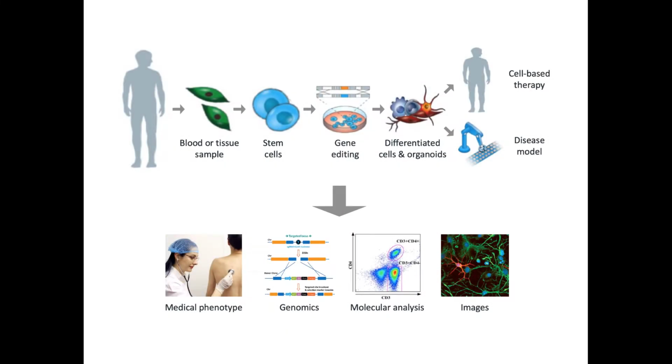As we all know, over the last 20 years, stem cell science has become enormously complex. Experiments take a long time and involve collaborations between many people and even different laboratories. In addition, data sets that we generate are large and complex because we're using the most advanced types of analytical technology for genomics, molecular analysis, imaging, and even linking to patient health records. This massive amount of data being collected in stem cell work really does present a data management issue.